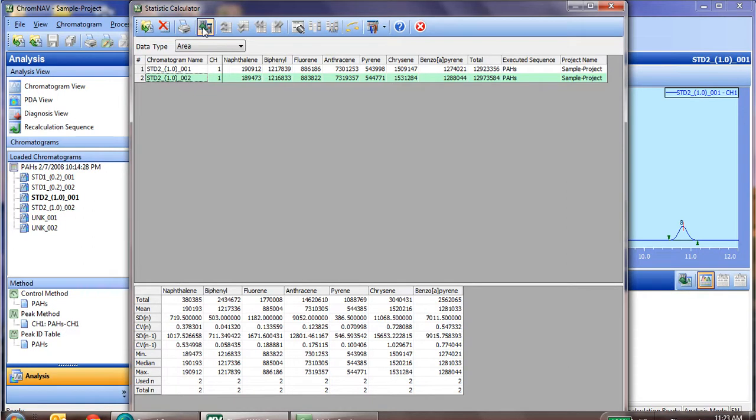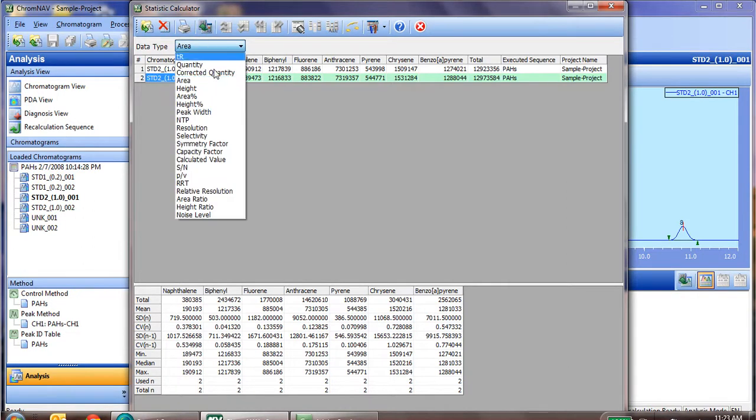Otherwise, that's all there is to statistics calculations. Again, you have a few other data set types that you can analyze for the relative standard deviation as well.